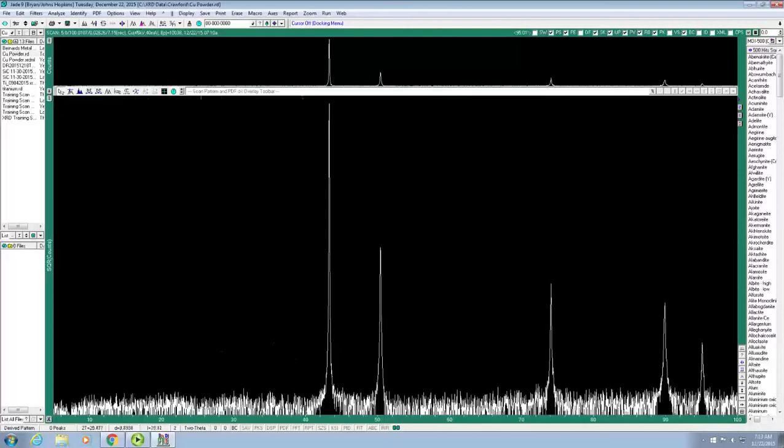All of this noise, a lot of this is probably caused by the glass slide that I used. I used just a regular glass slide on our data. If you want lower noise, so for example, here I had a large amount of copper powder. If you had only a very small amount of material, you may want to use a zero background slide.